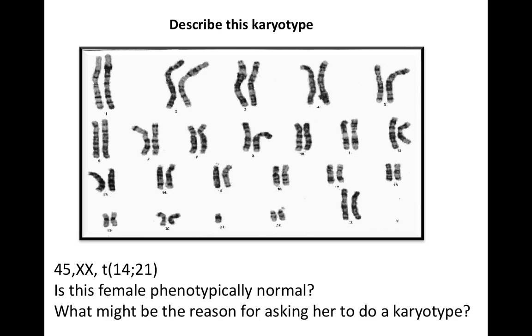And the second question, what might be the reason for asking her to do a karyotype? نتوقع ليه طلبنا إن احنا نعمل karyotype for this female. هناخد السلايد التانية وهي دي اللي will answer. We will go to the other slide which will answer this question.